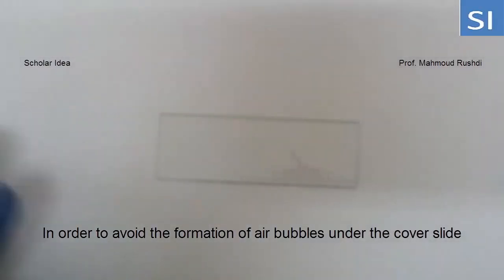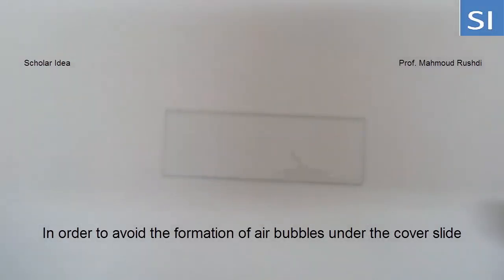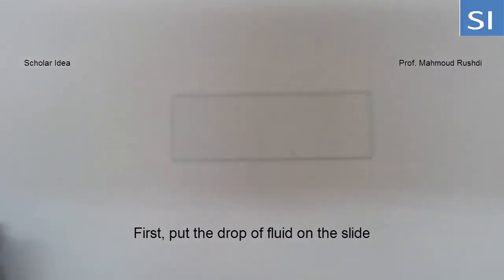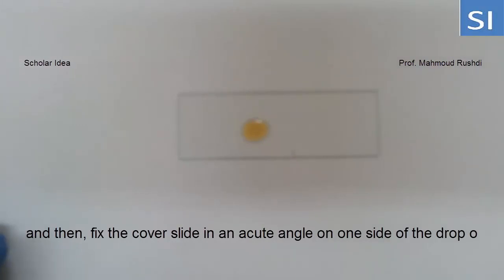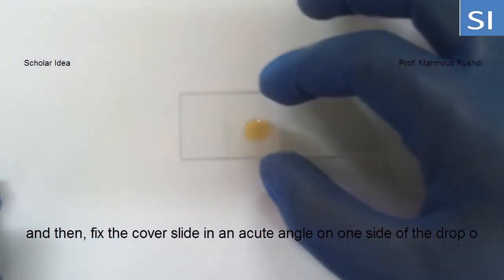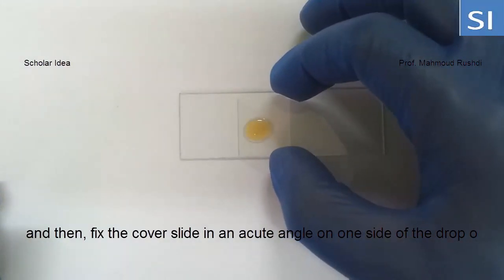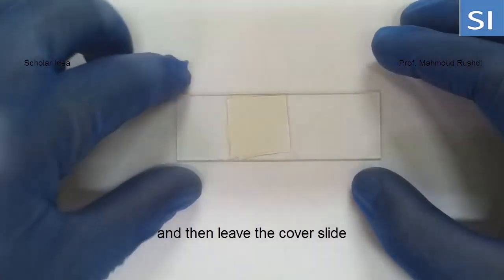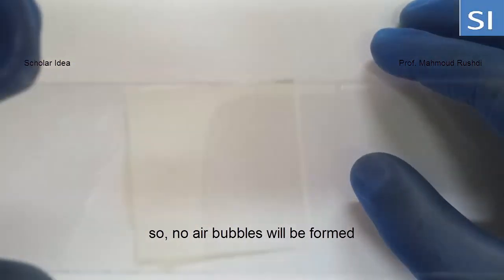In order to avoid the formation of air bubbles under the cover slide, first put the drop of fluid on the slide, then fix the cover slide at an acute angle to one side of the drop, and then leave the cover slide so no air bubbles will be formed.